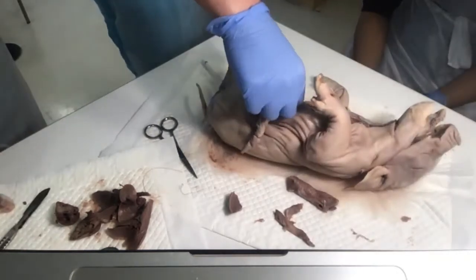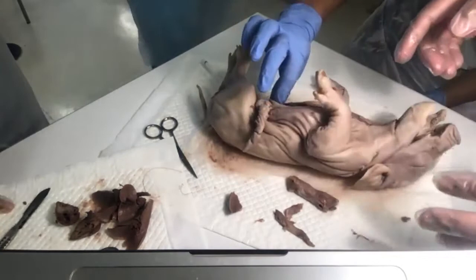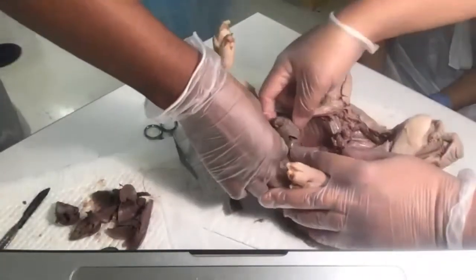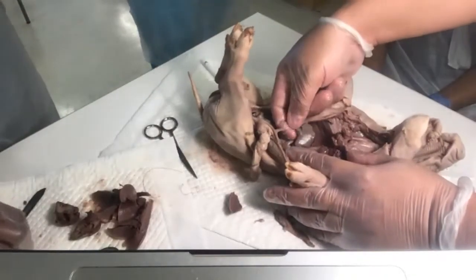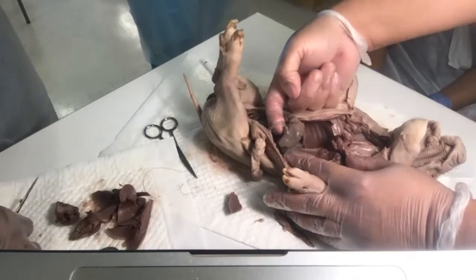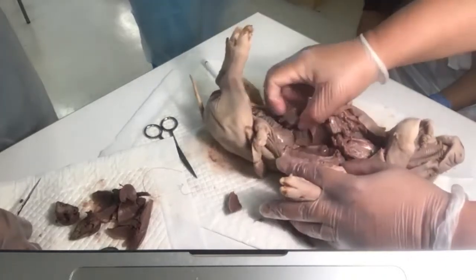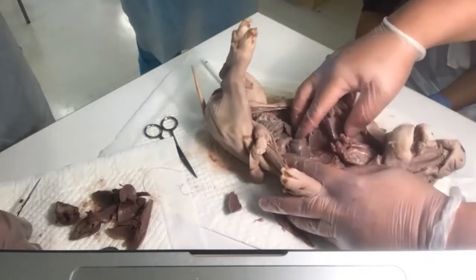And like I stated, there's coverings, like your fascia. There's things keeping your organs where they're supposed to be. So if I do anything to this, don't you think I'm going to have to attach this thing back in? And also, if you look at the ligament as well, there's arteries and veins in it. See? So take this out. Take out the liver and whatever is underneath it. Try not to cut too much.